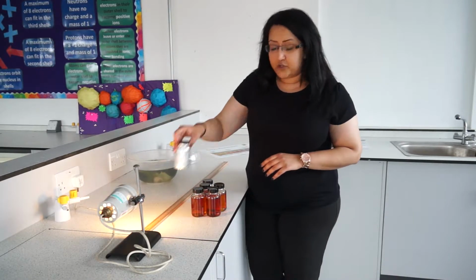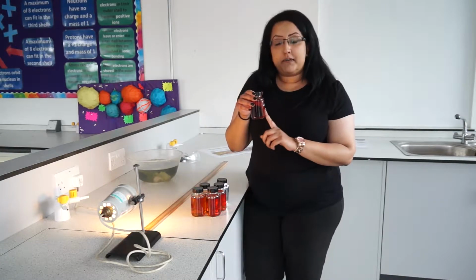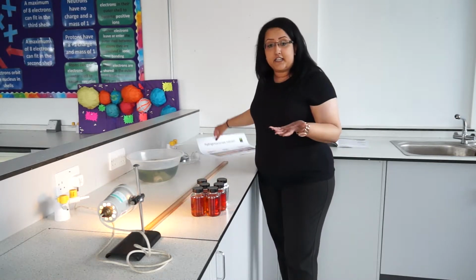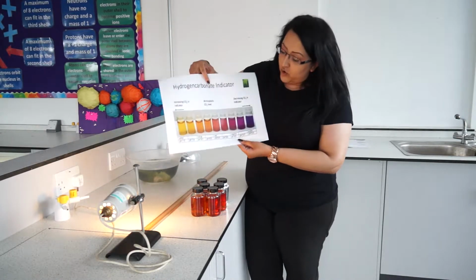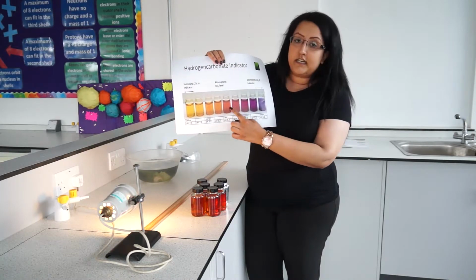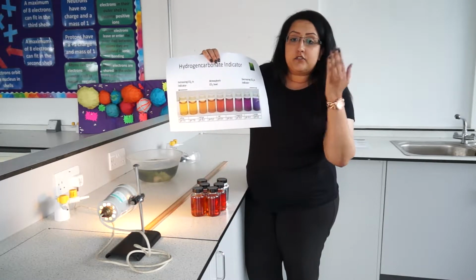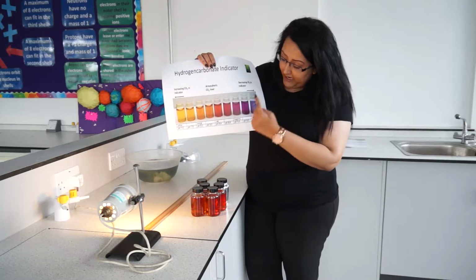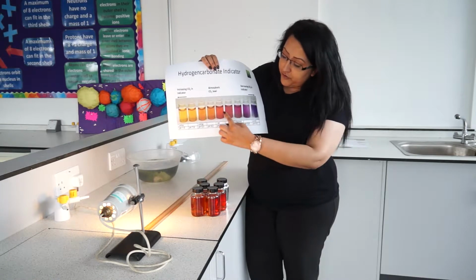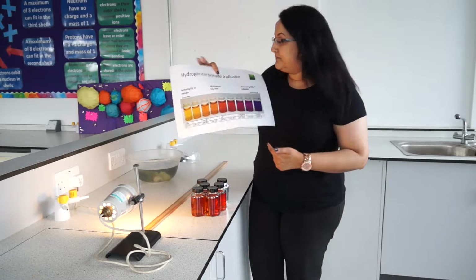You will need 6 bijou bottles, and in all of them is some hydrogen carbonate solution. What hydrogen carbonate solution does is act as an indicator of carbon dioxide. Normal, meaning atmospheric, levels of carbon dioxide will be this deep reddy colour here, which is what you can see these colours are. When the carbon dioxide levels begin to drop, it will get darker and darker, and eventually you'll get a purpley colour. If carbon dioxide levels were to increase, it would go from the dark orangey red to a yellow one. So we're going to be looking at a colour change today.